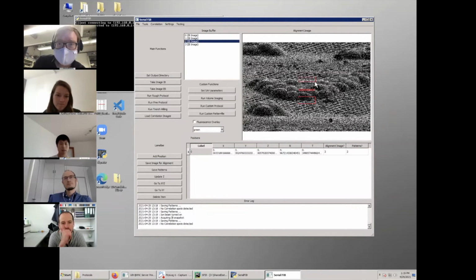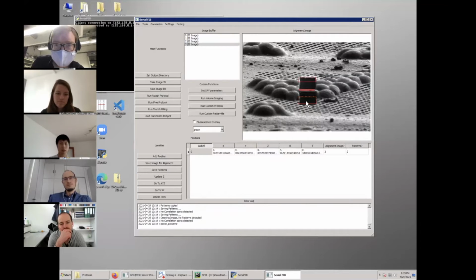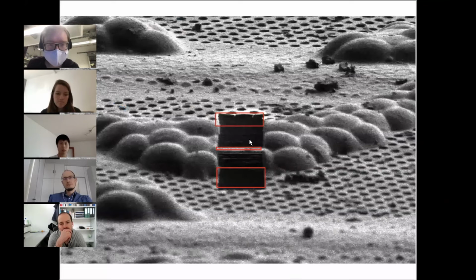Then you can toggle back to the second one, select these by clicking on them, pressing Control to select all of them at the same time, and then Control C, Control V them. You can go back into full screen and adjust this a little, because you already saw that it moves a tiny bit because of this nonlinear deformation.